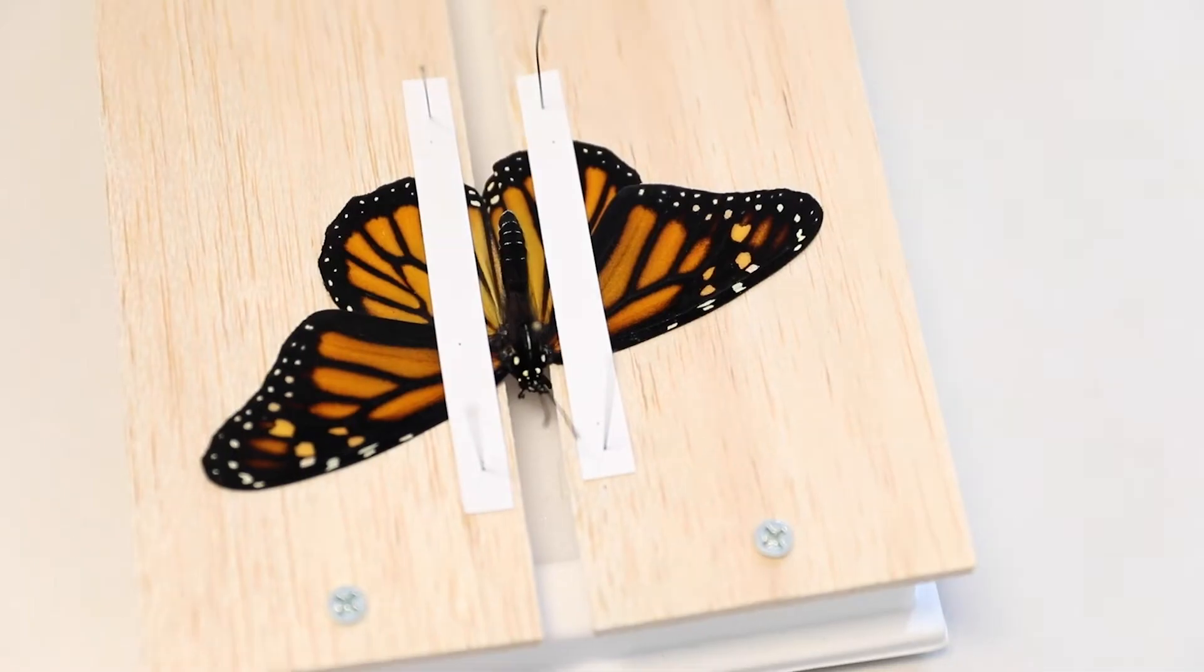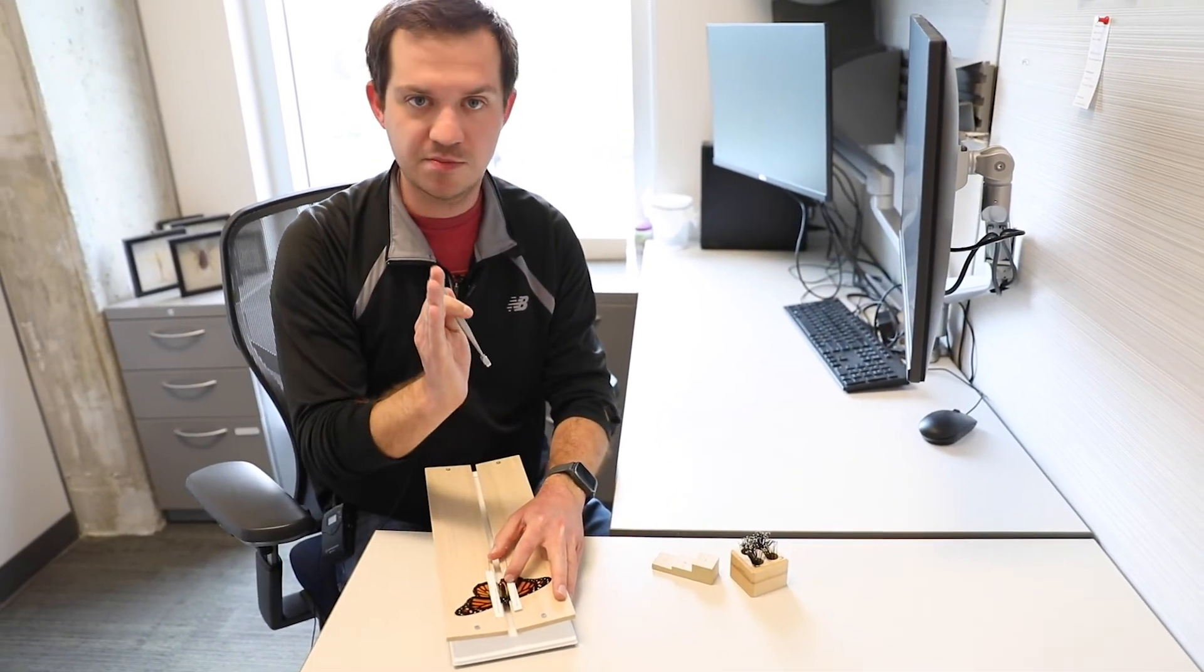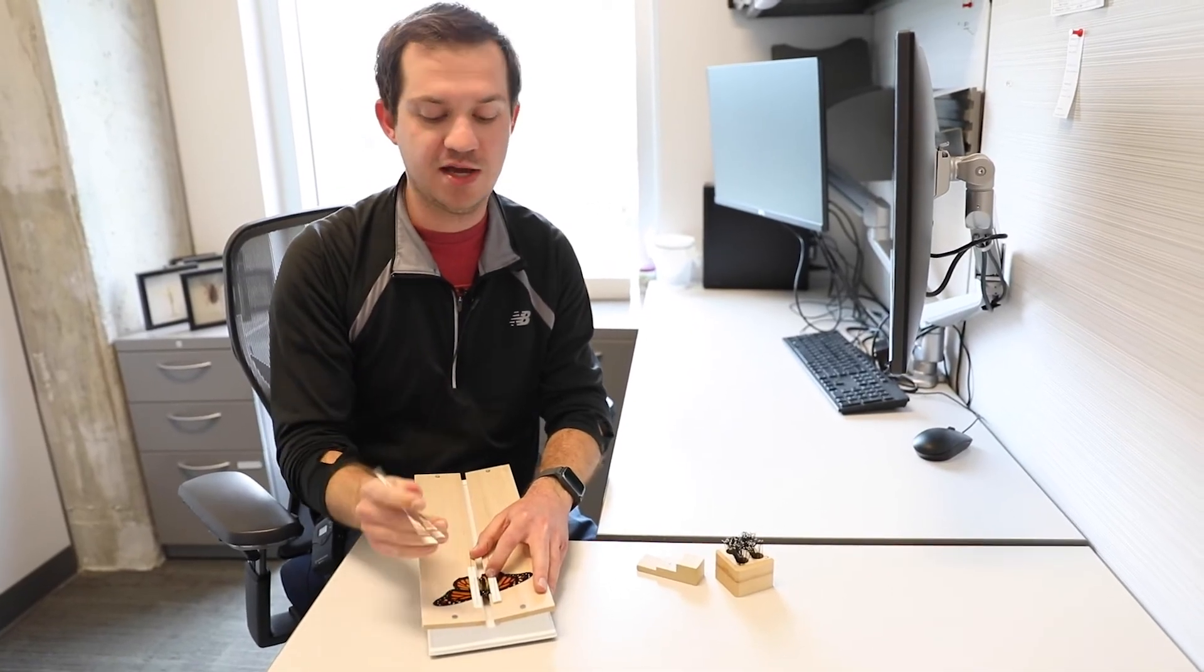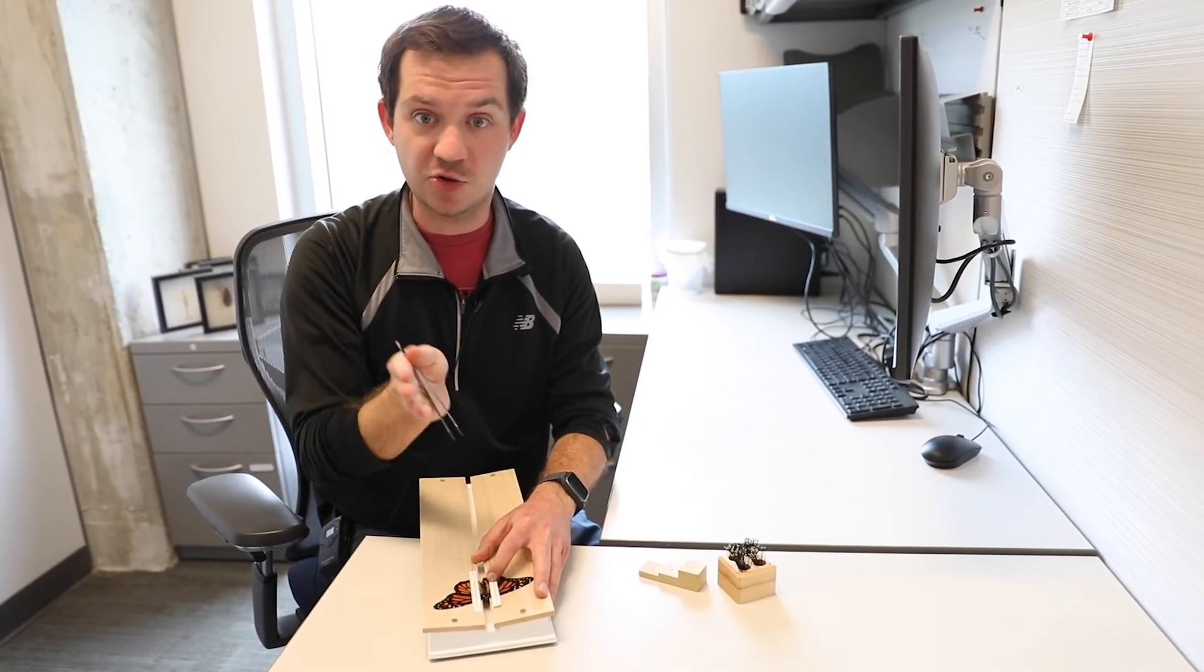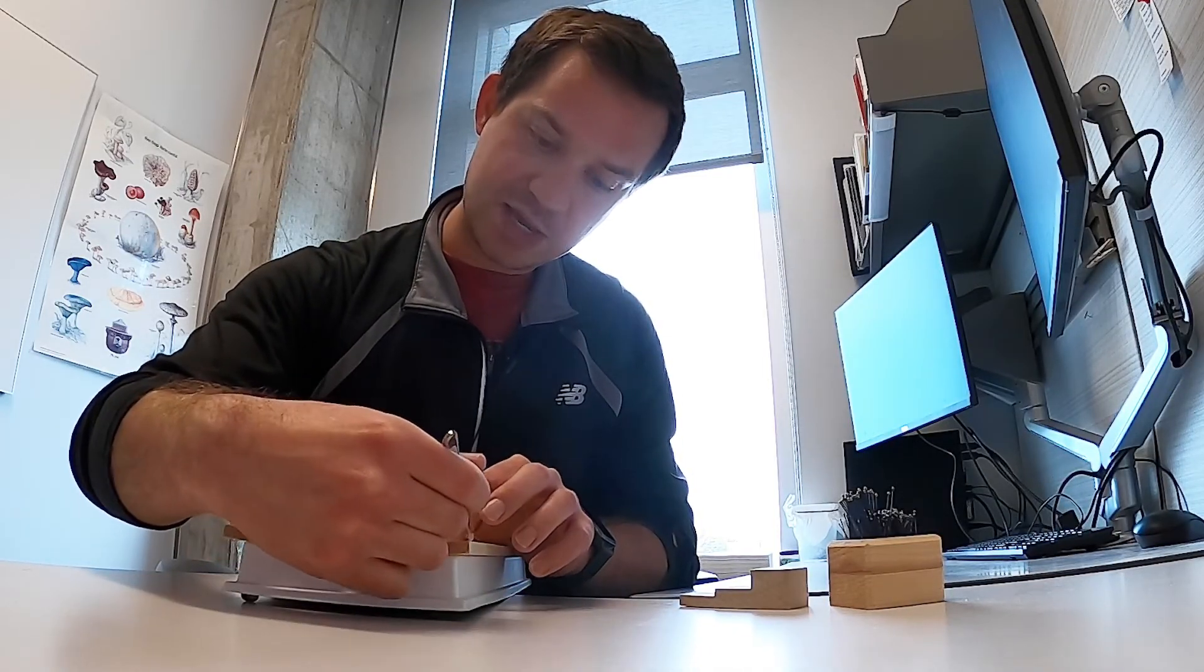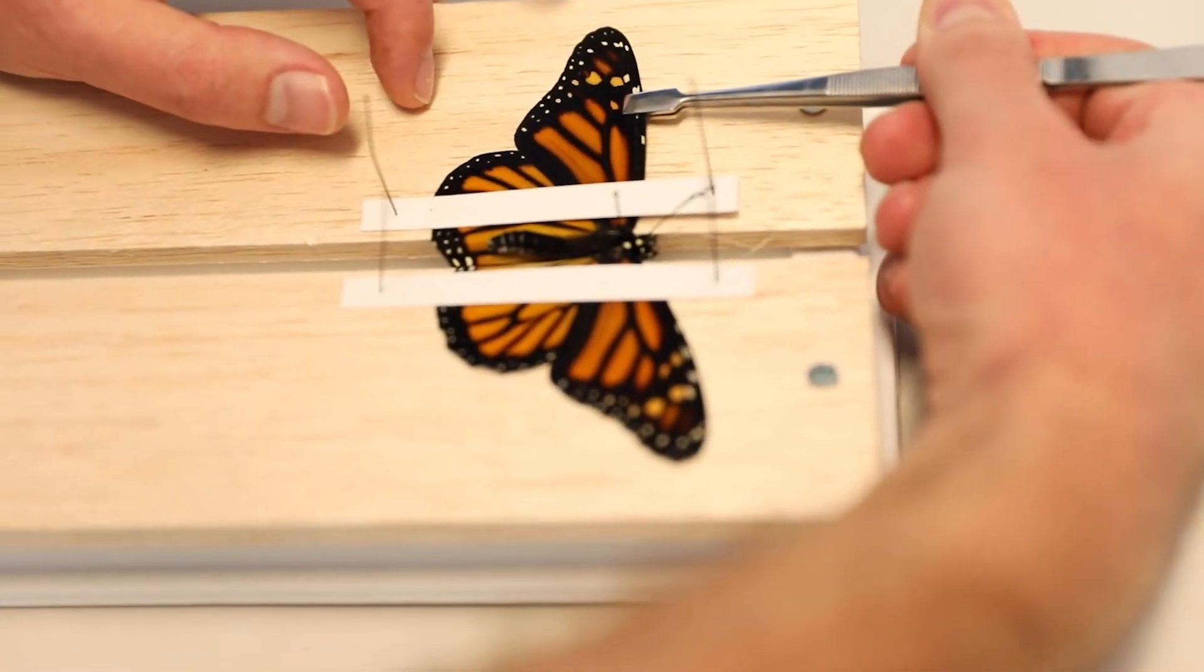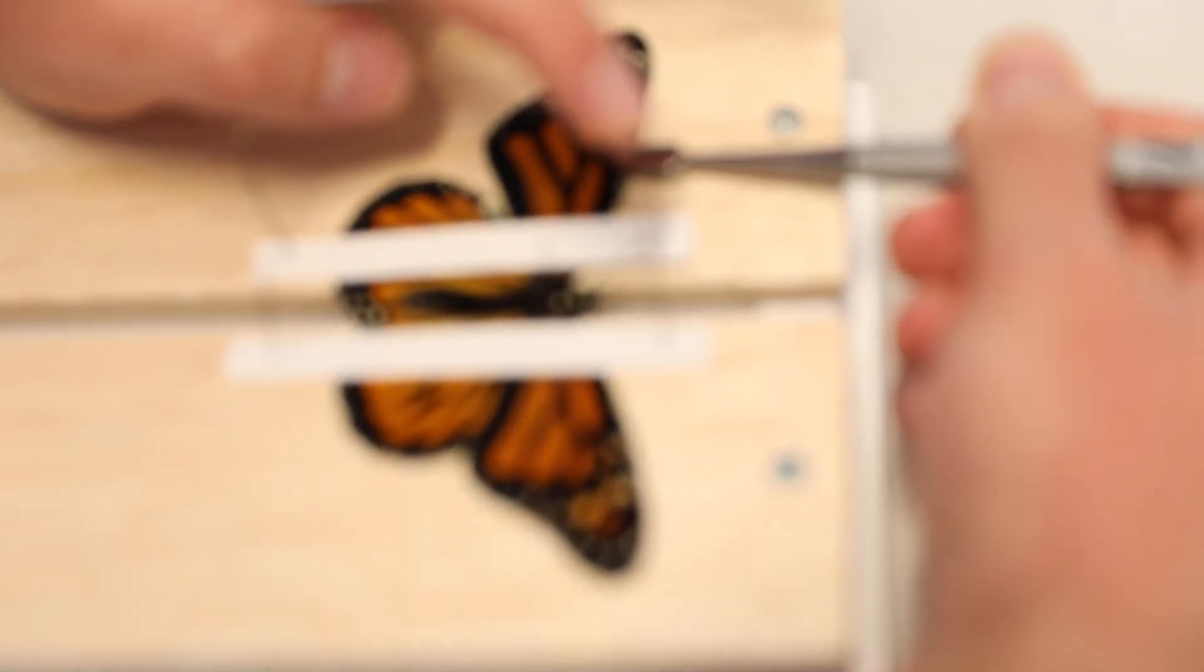From this point you do the same exact thing for the left side. Sometimes there are some fine adjustments that you have to make to ensure both sides are even. I'm just going to release pressure from that front wing, gently get my forceps underneath it, grab it by that top vein, and slowly move it up until it matches the other side, at least as close as I can tell. Push that pressure down again and I can release.